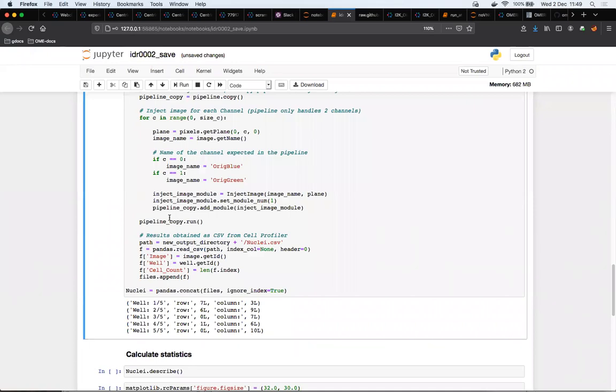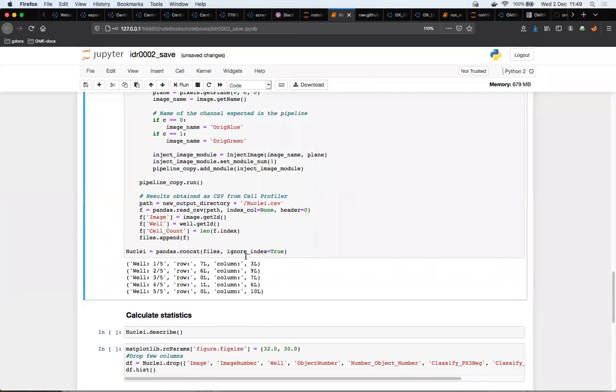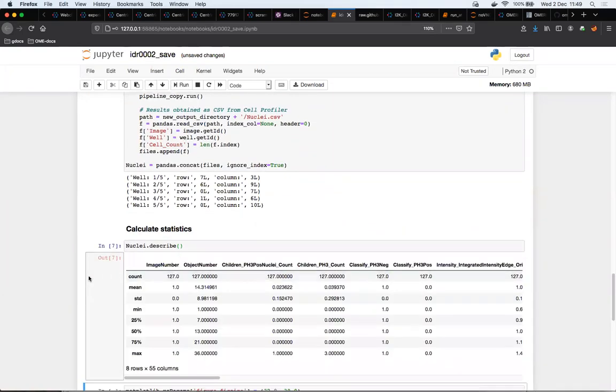You will be able, in that case, to get an environment where, if you want to explore with R or Python, just replace, like in the link before, with Python, and that will bring you to a lot of notebooks afterwards that you can explore and use with the credentials that we gave you. Okay, in that case, let's scroll down. The analysis is done, and after that, if you're not familiar, you can do some plotting, and then you can get the data.